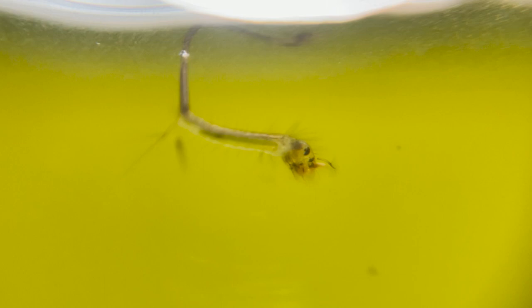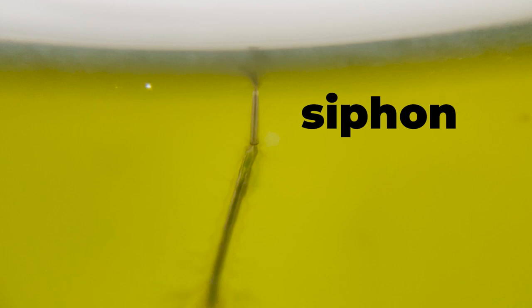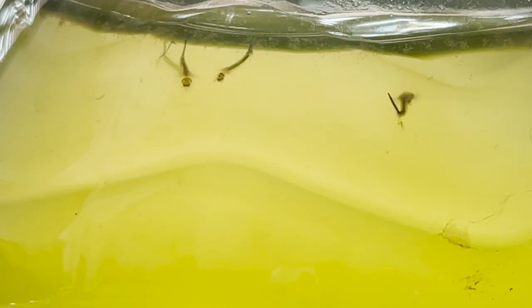So they're quite literally hanging, head down and rear end up, siphoning the air into their bodies via their butts. And the long tube at their rear end is called a siphon for that very reason. That leaves their heads free to do the important job of eating, which they do all the time. Except that is when they get a fright and they need to make a quick getaway. Without legs or fins or any way of propelling themselves sensibly, they just contort their bodies this way and that and wriggle away. It might look silly, but it's actually pretty effective.